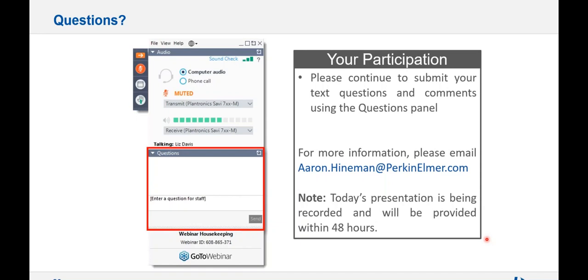You just move the set screw when you're at 1200 degrees and you look at counts, but that would be in the base module. That's a service related function. I don't know if it's that critical. It doesn't seem to change it that much, but you move the set screw based on the counts in the service module. So that's what service would do.